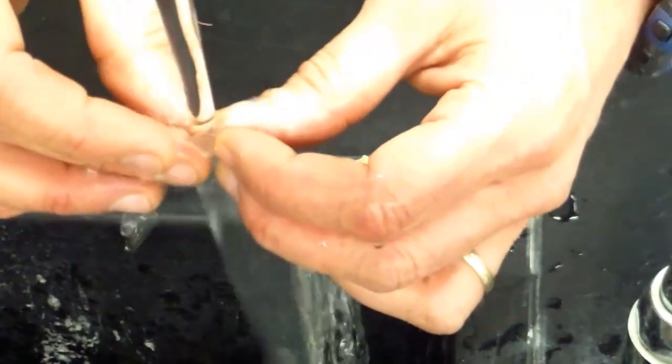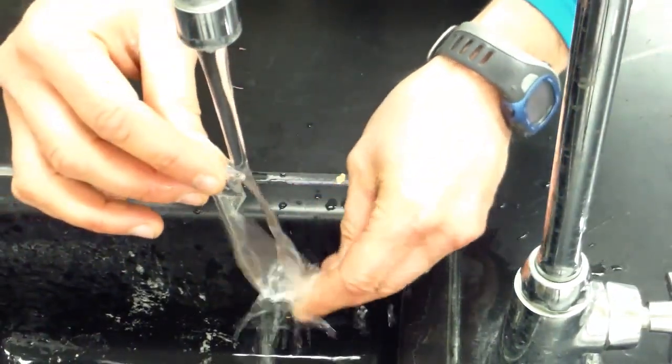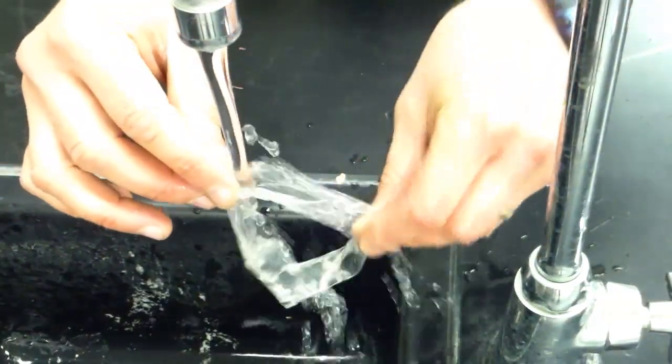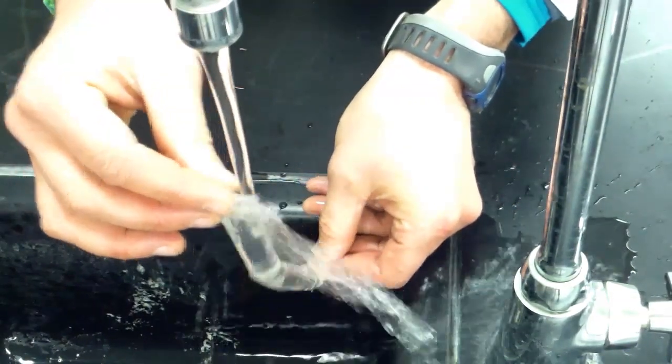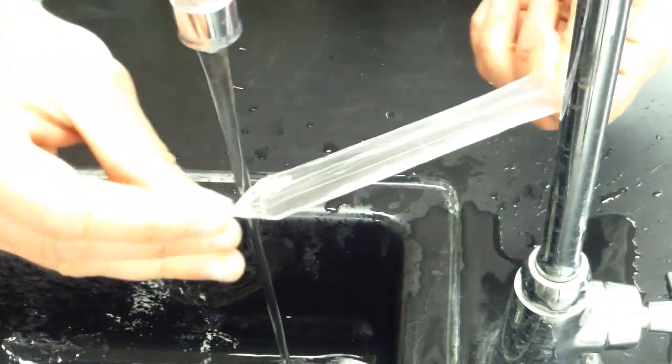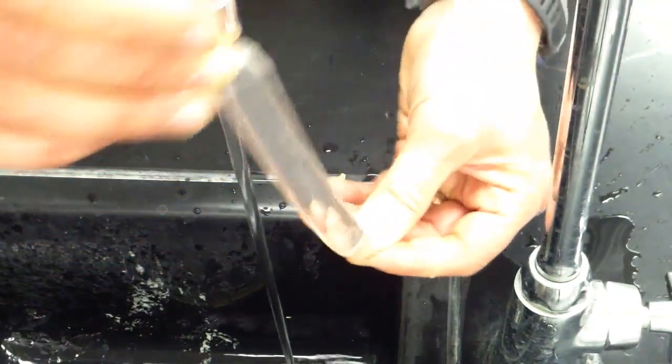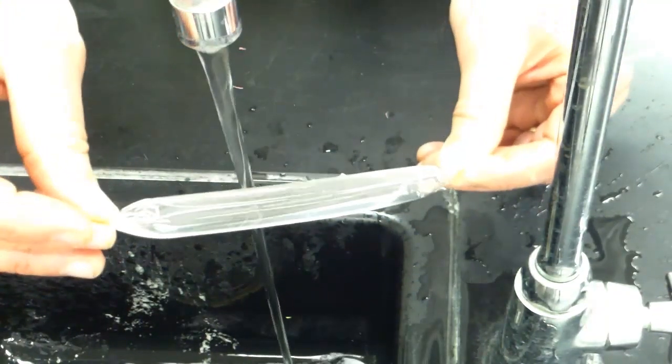And then if you carefully try to get one end open and hold on to the other end, you'll see very quickly that it turns into an actual tube. So this actually has water inside and it has turned into a tube that's open on both ends. So that's the first stage.